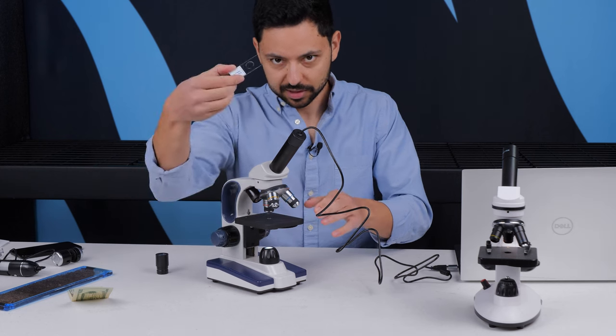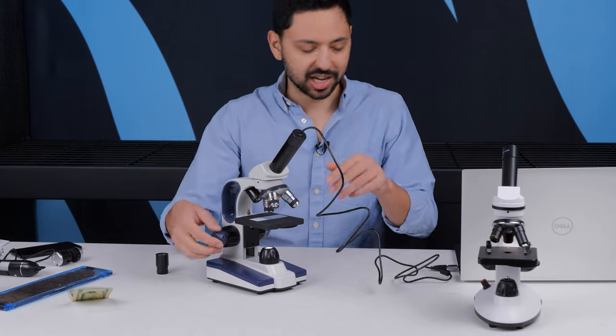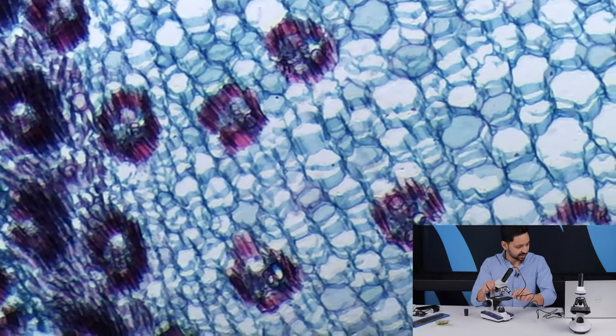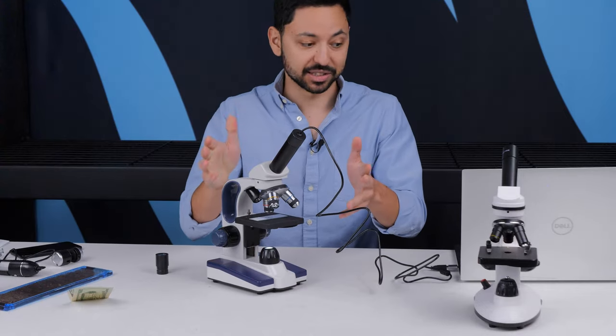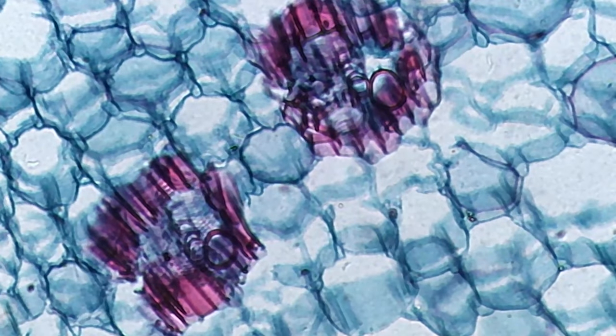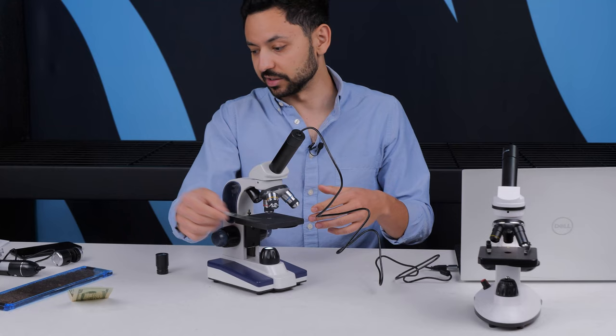I've set up the MS205T with the same sample slide for comparison. At the lowest magnification — a 4x objective — you can already see the difference in image quality is pretty substantial. I'm going to flex the stage and you can see it moves slightly but doesn't go out of focus, which is really the important thing: the metal frame lets you actually see at high magnifications. Moving up to 400 times magnification, the focus becomes increasingly critical, but it looks great with no complaints.